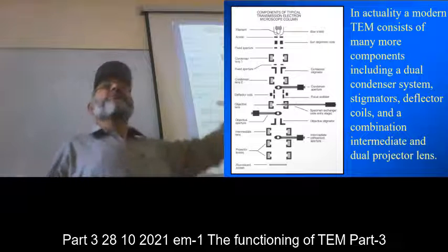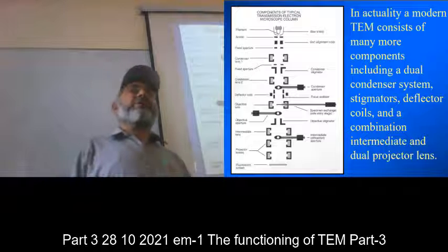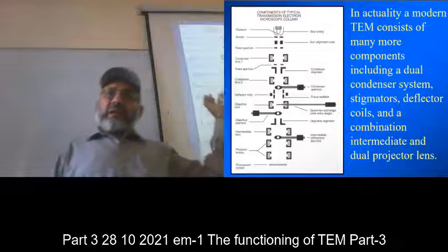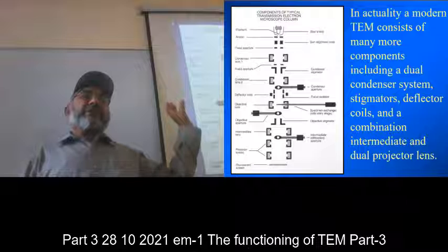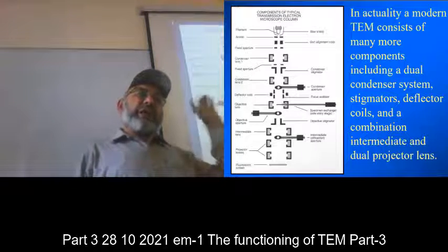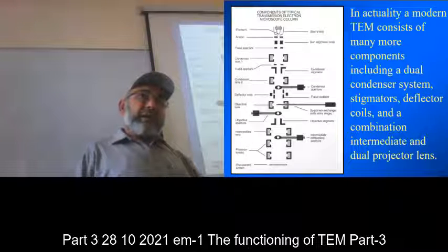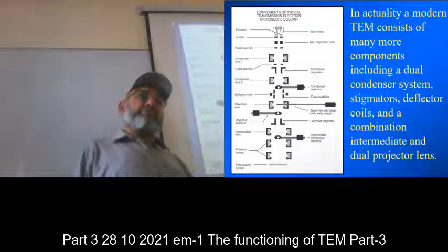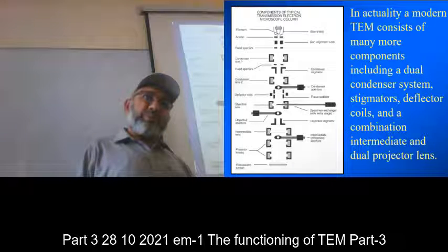So when people go towards high resolution microscopy, they need further and further refinements. High resolution electron microscopy means that you are interested in looking into the atomic planes. After optical microscopy, the technique developed was the conventional transmission electron microscope.